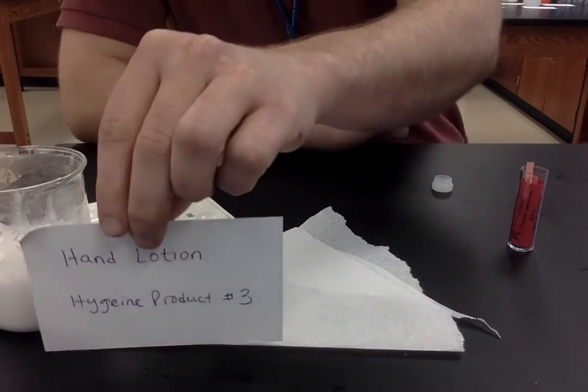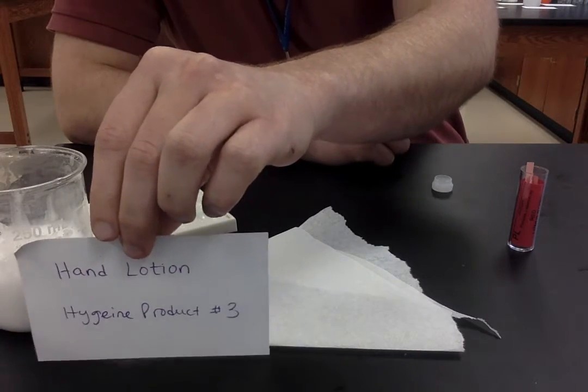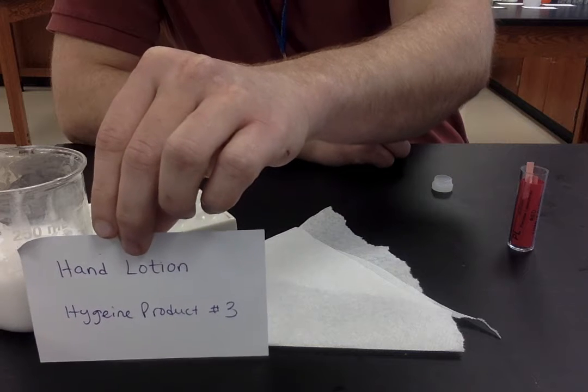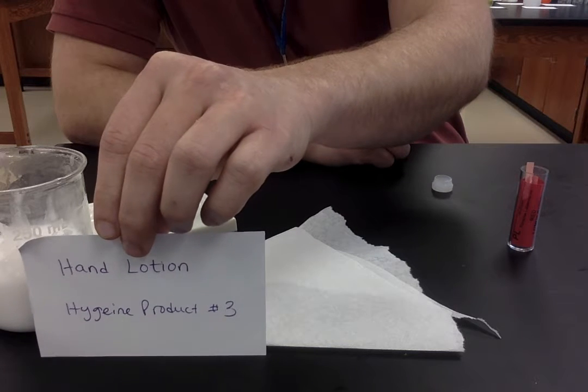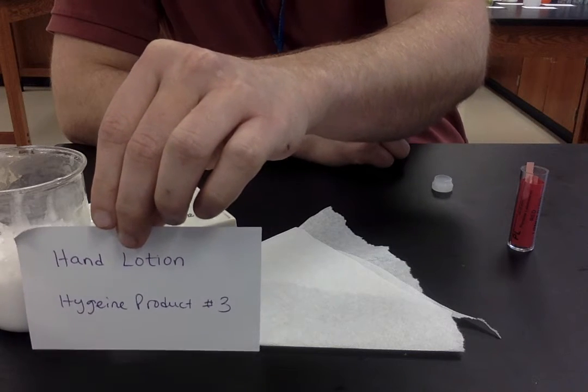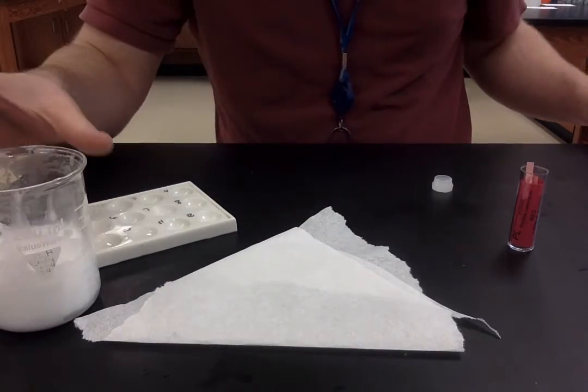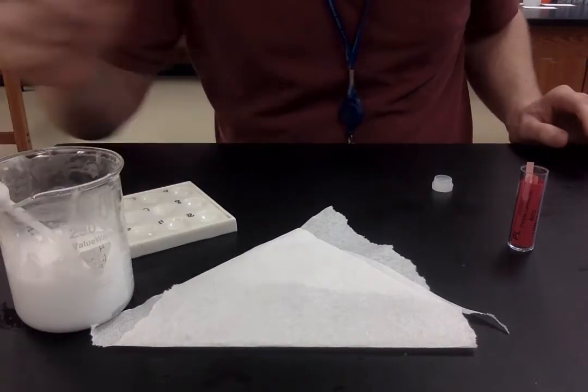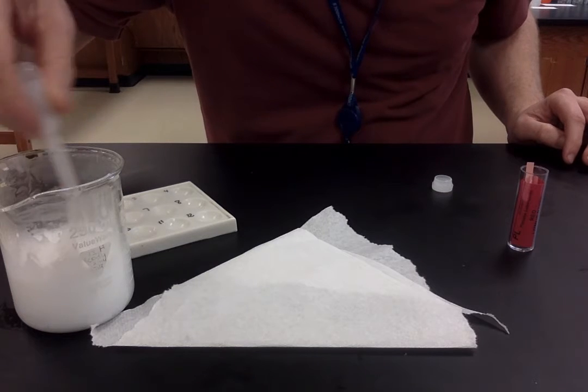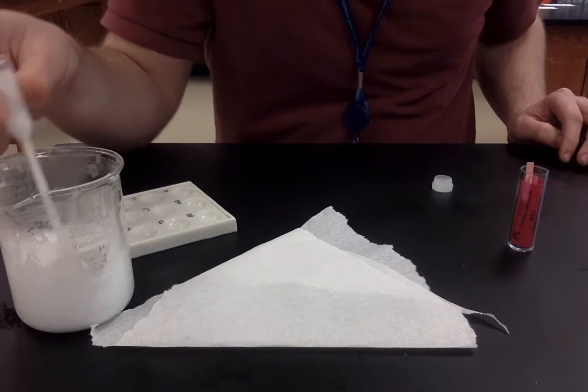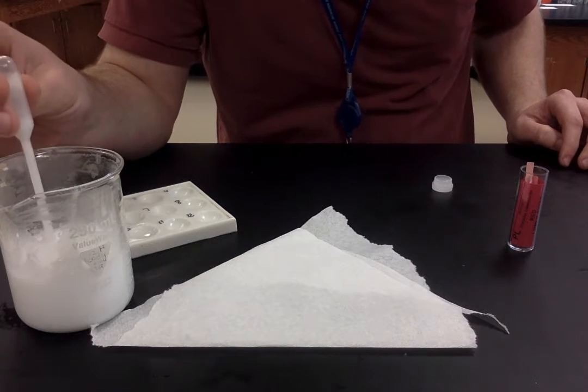All right folks, in trial three of part two of the household acids and bases lab, our third hygiene product is going to be hand lotion. You can see I got a thing full of hand lotion here. I will say I did dilute it, so I put a bunch of water in there to make it so that I could suck it up easier in the dropper.